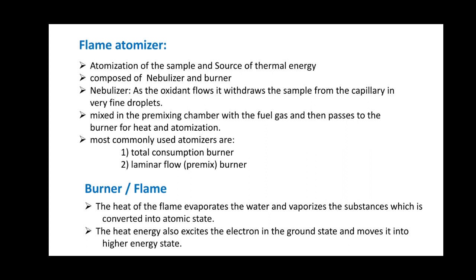The most commonly used atomizers are the total consumption burner or laminar flow burner. As a burner or flame, the heat of the flame evaporates the water and vaporizes the substances, which are converted into atomic state. So here the flame provides heat energy.